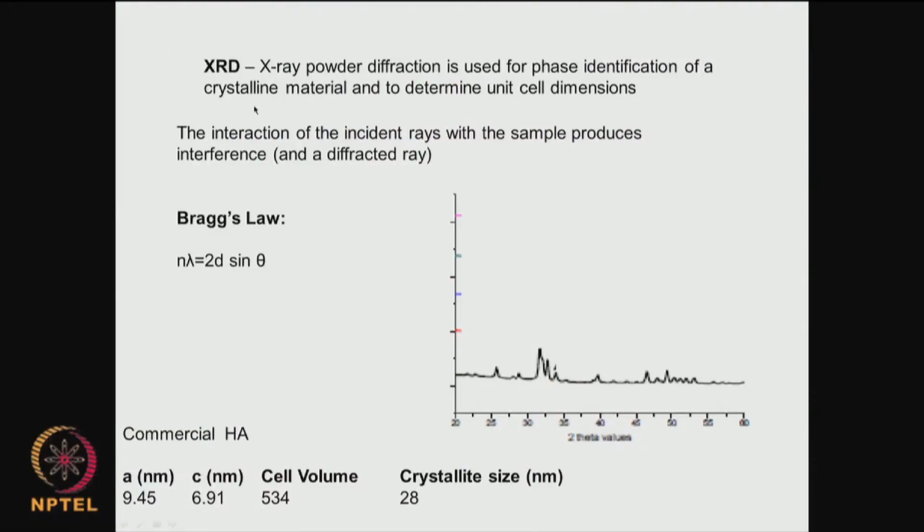There is a protein data bank, PDB, and if you go into that you can see the 3-dimensional structure of a large number of proteins. So for crystallizing proteins and then looking at their 3-dimensional structure, again we use the X-ray diffractometer.